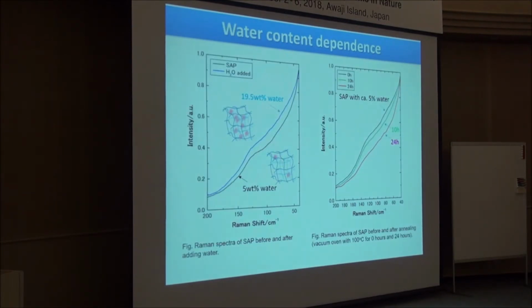We also tried to measure adding and removing water in the SAP 3D network polymer structure. This figure shows the Raman spectra of SAP before and after adding water.